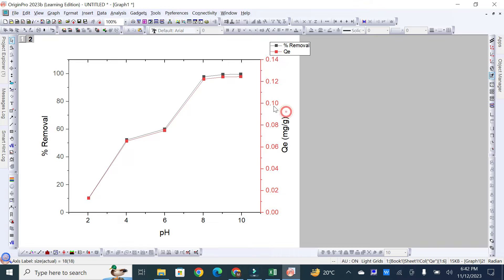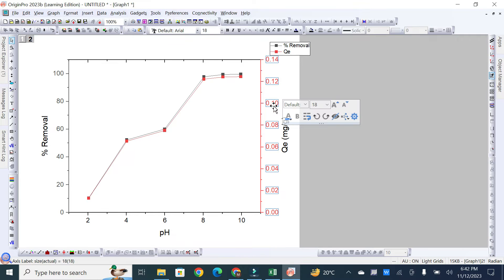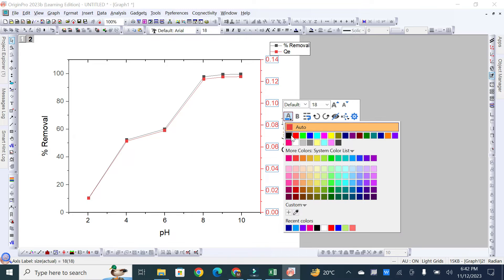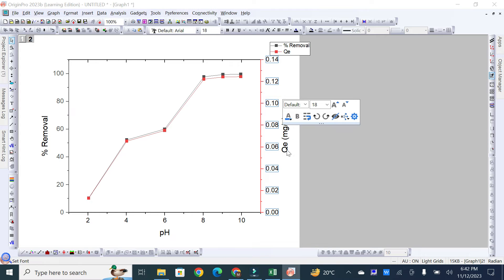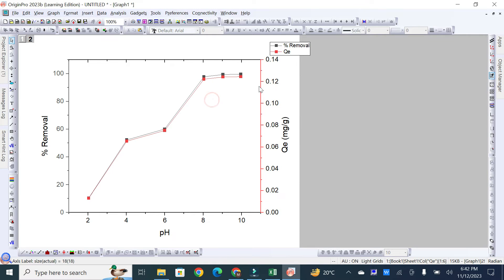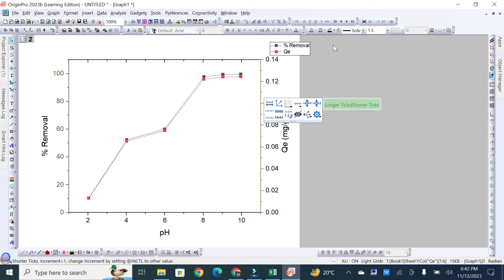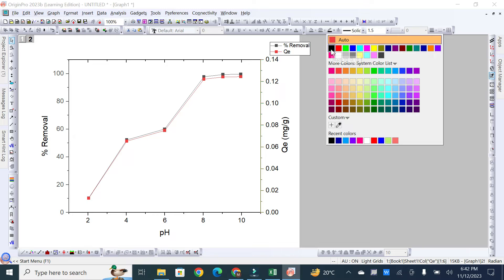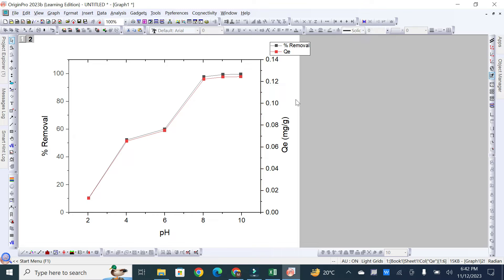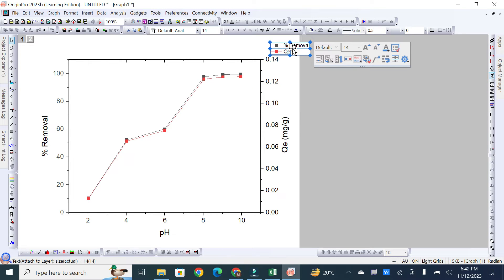If you want to change the color of a line to black, just click on it and an option will appear. You can simply change the color to black. Similarly, if you want to change the other line's color, click on it, and it will ask what color you want to choose — for example, you can select black.